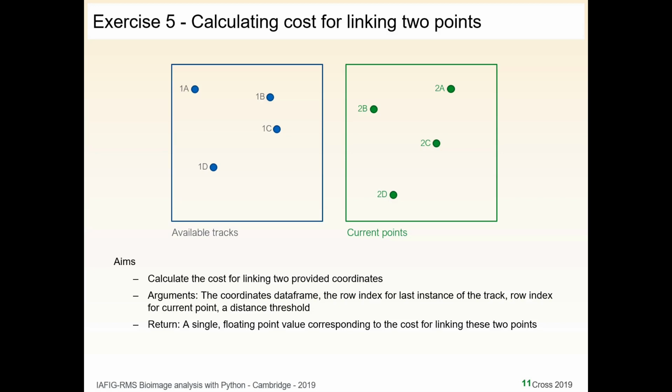We use the Hungarian algorithm, as said before, also known as the Kuhn-Munkres algorithm, to calculate the optimal assignment of all those points, such that we're only able to assign one previous track to at most one current frame point. Right now we're not actually going to do that, but I'm just going to talk through a little bit of the logic about how it works.